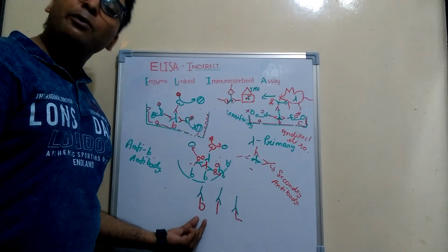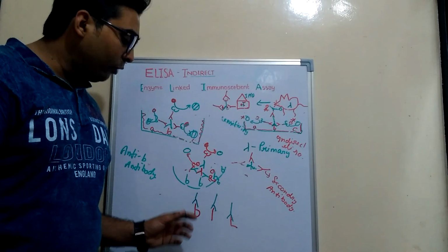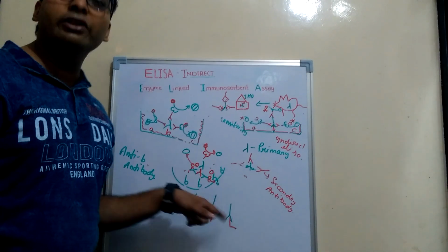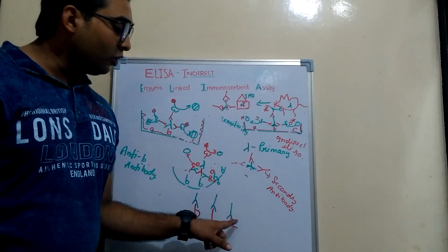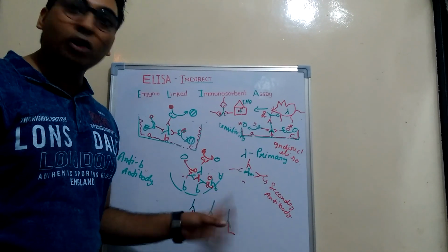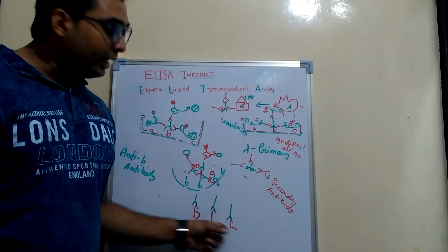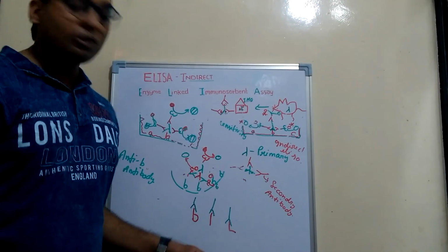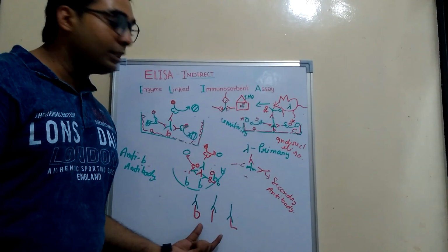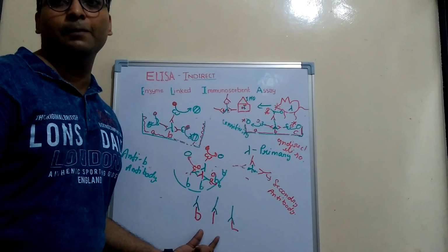It means that if you have no antigen B, then that antibody will bind to I, and it can bind to L, and you will use secondary antibody, then it will bind on the primary antibody, because on washing that will not wash away. Why will that not wash away? Because it has affinity for the antigen. So here again you are not going to find a clear test. So this indirect ELISA will fail.